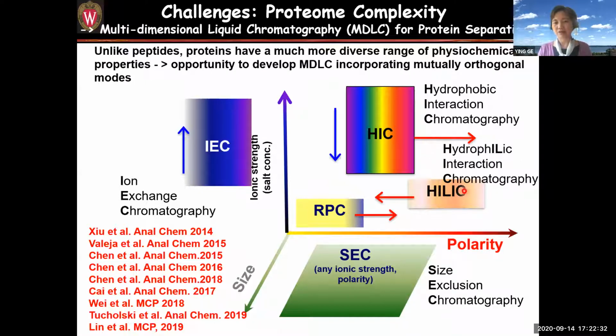For example, hydrophilic interaction chromatography. Again, this is pioneered by Ben's lab. They separate histones. My lab works a lot on hydrophobic interaction chromatography. We also try to couple with ion exchange chromatography and SEC.